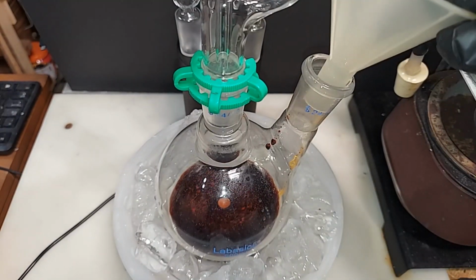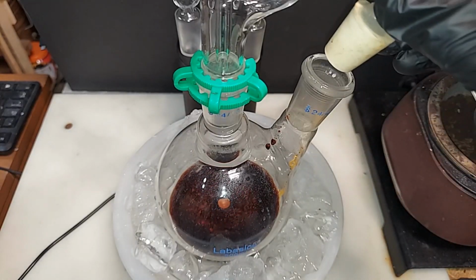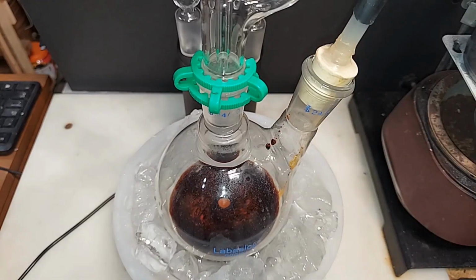I'm going to keep mixing this until there are no more particles of the potassium dichromate left, and then maybe another 10 minutes just to make sure. I'm not going to video that. That will be quite boring. But once that's done, we'll add the methanol. The other reason we're keeping this cold, of course, is any formaldehyde that's produced early on will stay in the solution due to the colder temperatures and because of the hemiacetal effect.